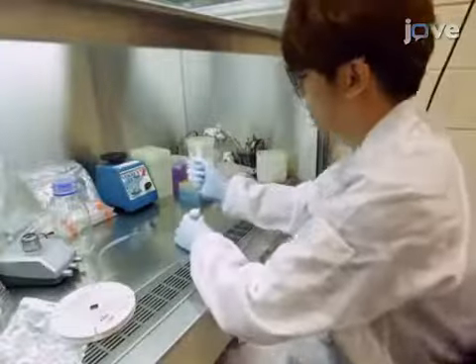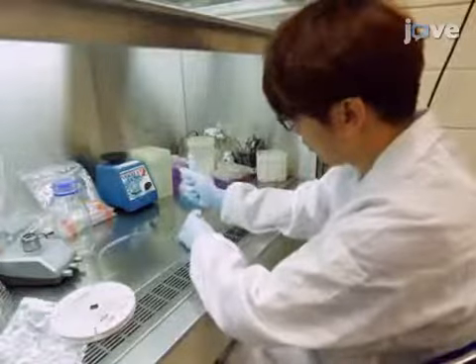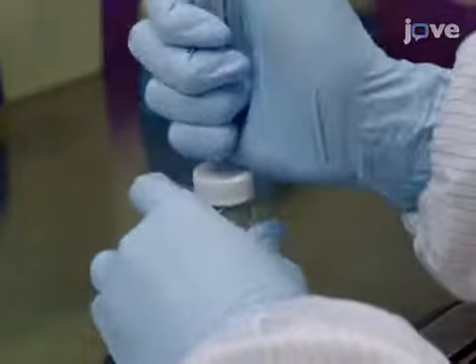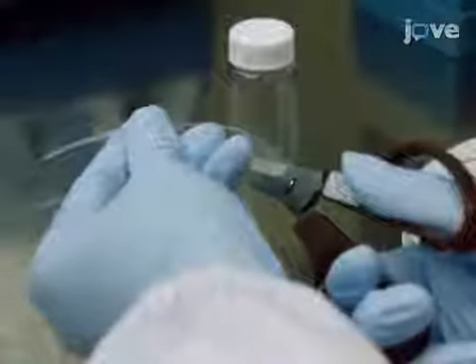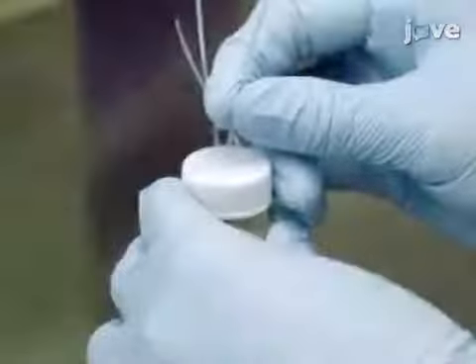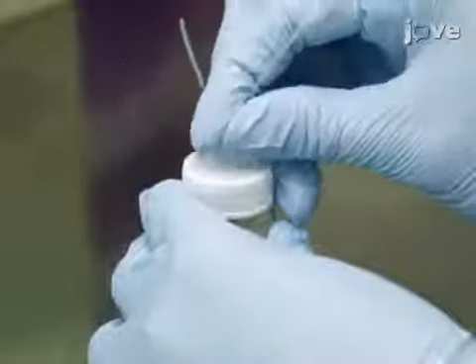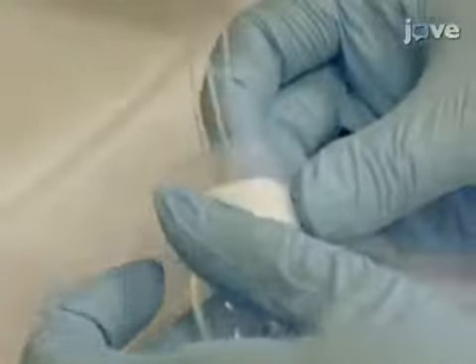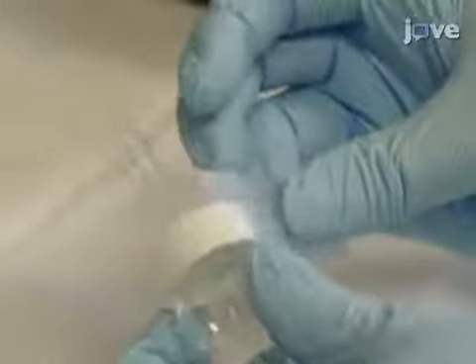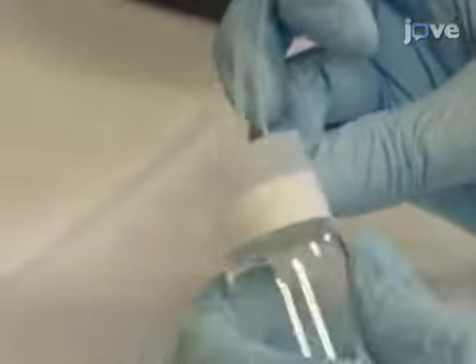To assemble the morbidostat, begin by using an 18-gauge needle to punch 3 holes into the cap of the culture vial. Cut 3 pieces of polyethylene tubing approximately 7 centimeters in length and insert them into the holes in the cap. Use tape to wrap the edge of the cap to serve as the cast for the polydimethylsiloxane, or PDMS, mixture.